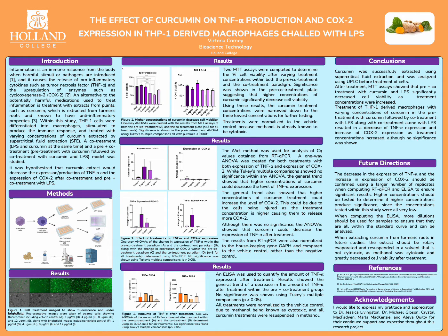To make the treatment, curcumin was extracted using supercritical fluid extraction with an extraction pressure of 300 bar, CO2 at a flow rate of 1.5 ml per min, and a temperature of 35 degrees Celsius. Reagent alcohol was also used as a modifier. After SFE, the extract was rotary evaporated and resuspended in methanol. After that, the extract was analyzed using UPLC, using a C18 column and 0.1% phosphoric acid as mobile phase A and acetonitrile as mobile phase B.